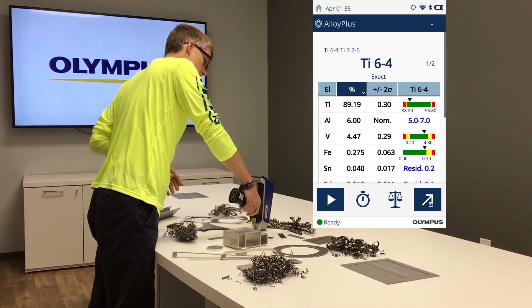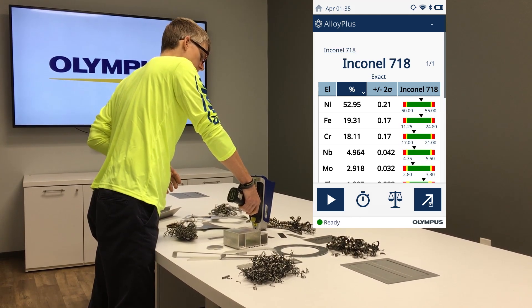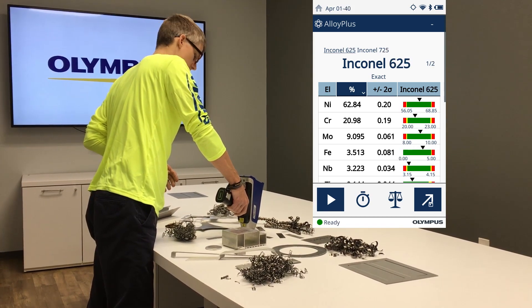We can hit some nickel-rich alloys here. Money in your nickel. Inconel 718 — Inconel 625.